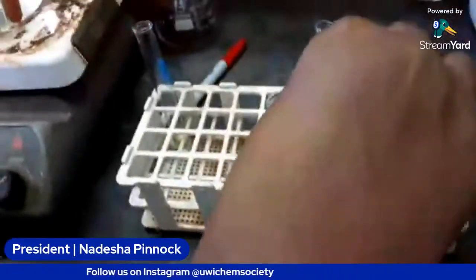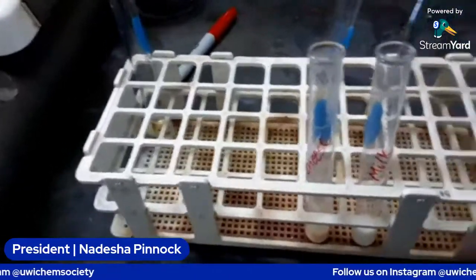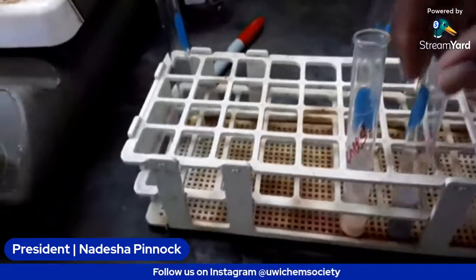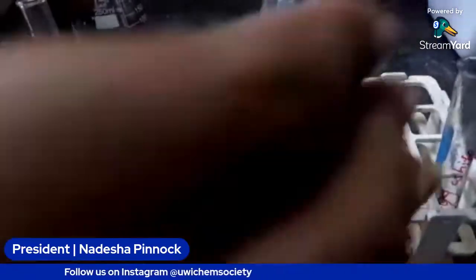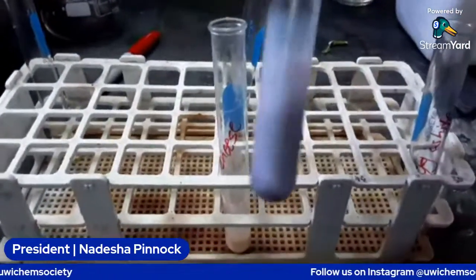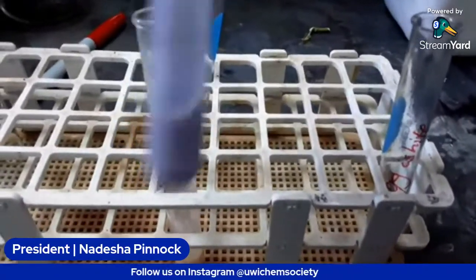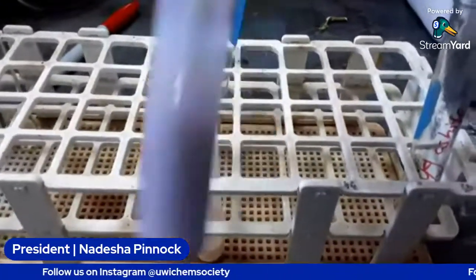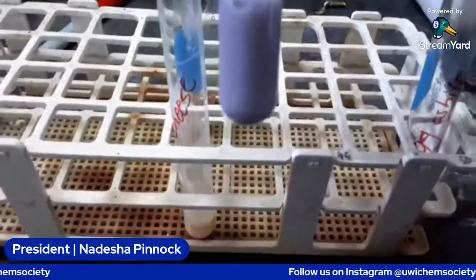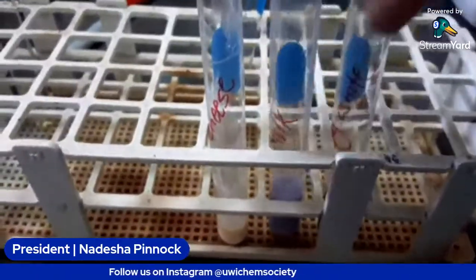We're going to add about 1 mL to the milk as well. This is the milk. Right, as you can see, the color is changing. This is more like a mauve color. Yeah, because the milk was initially white, so it's not going to be as purple as the egg white.